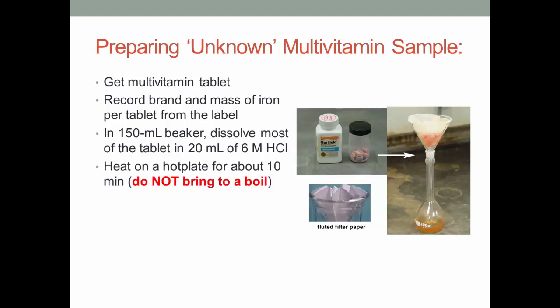Next, you will be heating the solution on a hot plate for about 10 minutes. This ensures that all of the iron is dissolved, but do not bring it to a boil.